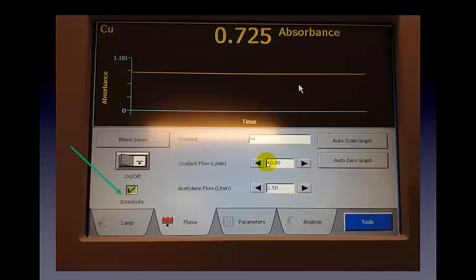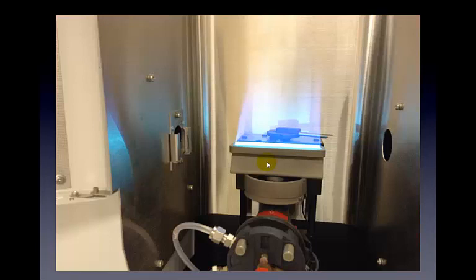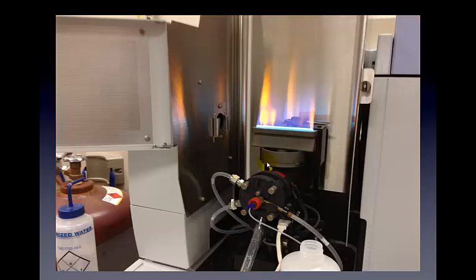Once you press OK, you can see that the interlocks now have a check box, indicating all interlocks are clear, and we are free to start up the flame. The flame appears in a very light blue color. Right now we are passing plain DI water through the flame, so there should be no color to it. Once you add your samples you may notice the color changes slightly and you start seeing some yellows — if it's not a consistent color, that's a sign of a problem, so make sure you don't have any clogs and flush the sample introduction system with water or dilute nitric acid.